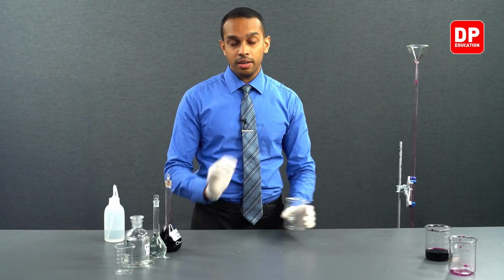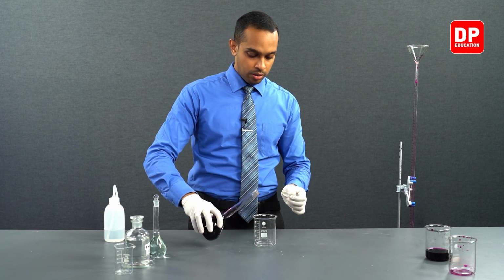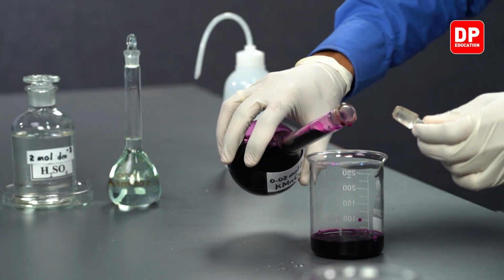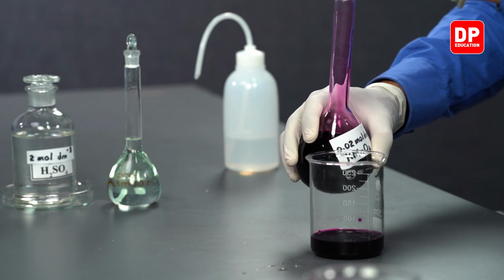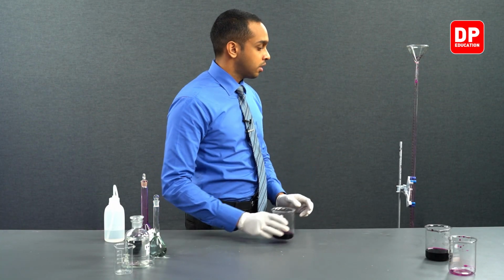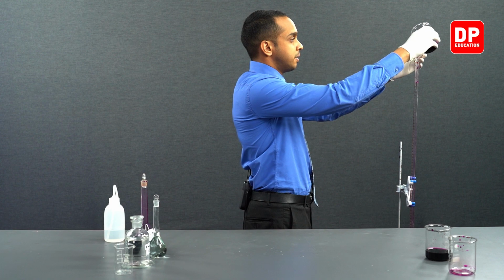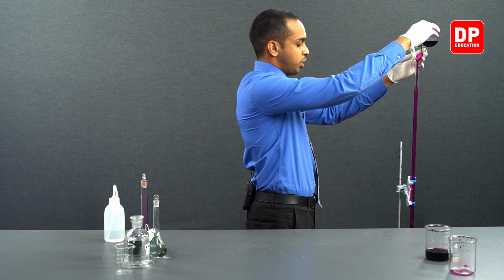After placing the funnel, let's take another beaker and transfer some of the liquid, or the sample, that we need to fill into the burette. Let's take a little over 50 milliliters, because the burette can hold only 50 cubic centimeters. And now, after making sure the burette tap is closed, we will start adding the potassium permanganate solution into the burette.